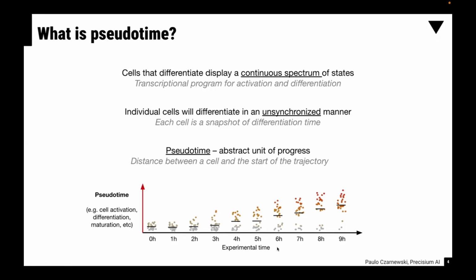While your experimental time might sometimes be related, as you can see, many activated cells are there, this is different from the pseudotime. That is a key difference that you need to consider, because the pseudotime is more about the genetic development rather than the temporal one itself.